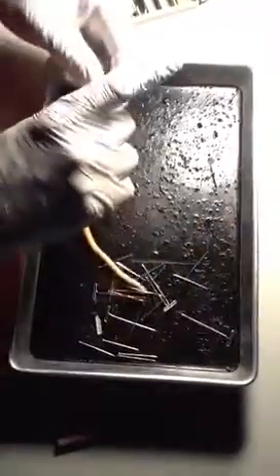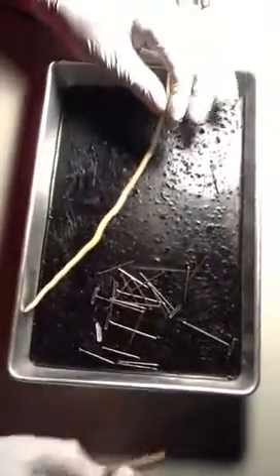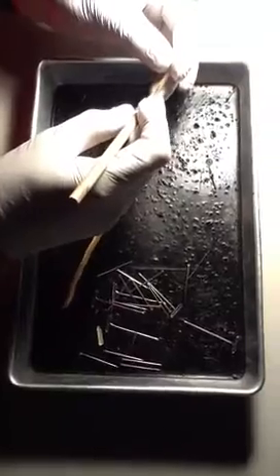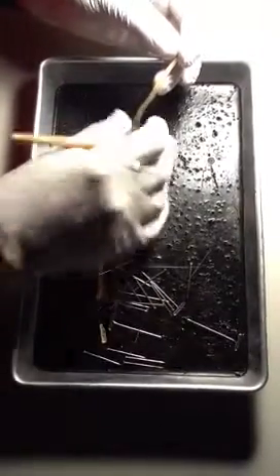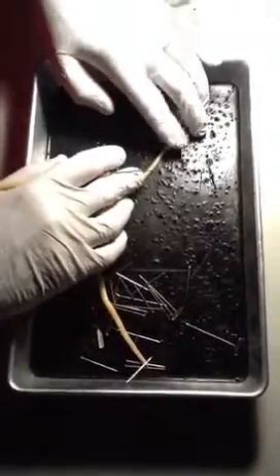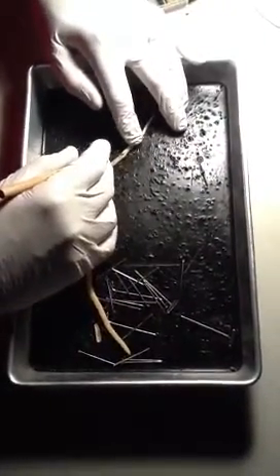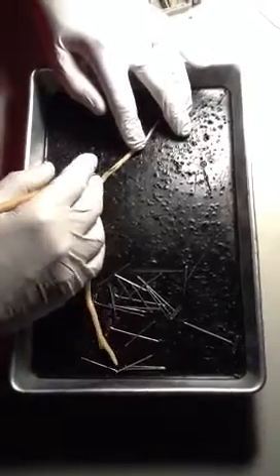I want to start cutting near the head. To do that, make sure the worm is kind of flat. Take the probe and insert it into the skin — it just pops right in. And then I just kind of unzip it. Once I get it unzipped a little bit... there it is, I just keep unzipping.